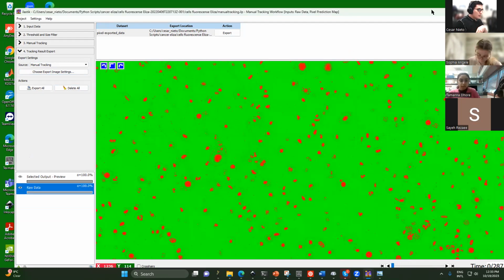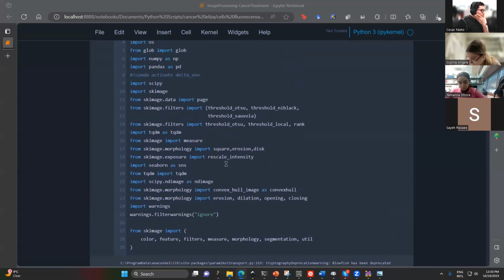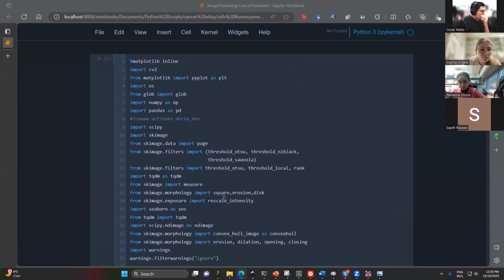And I export it. And I can now open the Python script that I sent you. Let me check. Where is it? Okay, so this is the program I sent to you.